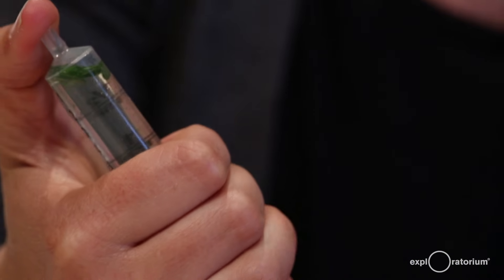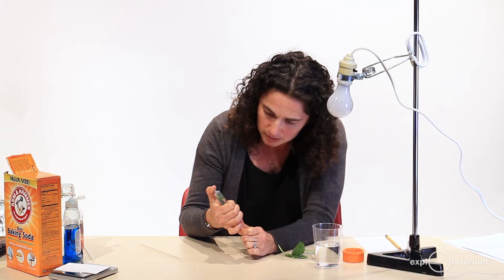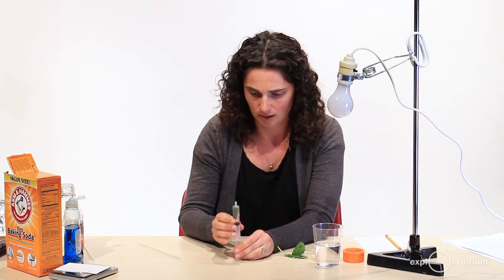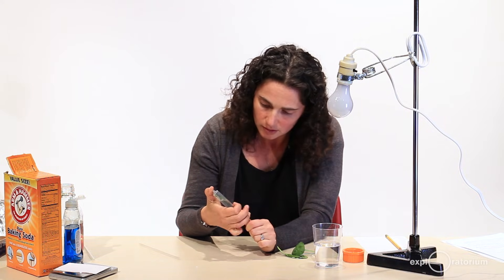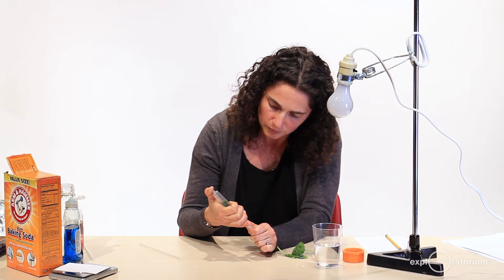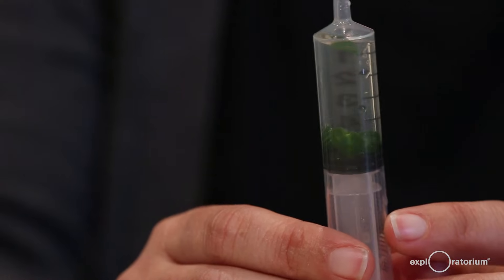I'm going to put my thumb over the tip of the syringe to make a good seal, then pull gently on the plunger. When I do that, I see little bubbles coming out of my leaf discs. I'll pull back a few milliliters and then release, and tap a couple of times to dislodge any bubbles — the leaf discs should start to sink. I'll repeat this a few more times, applying a gentle vacuum and releasing, until most of the leaf discs have settled to the bottom.